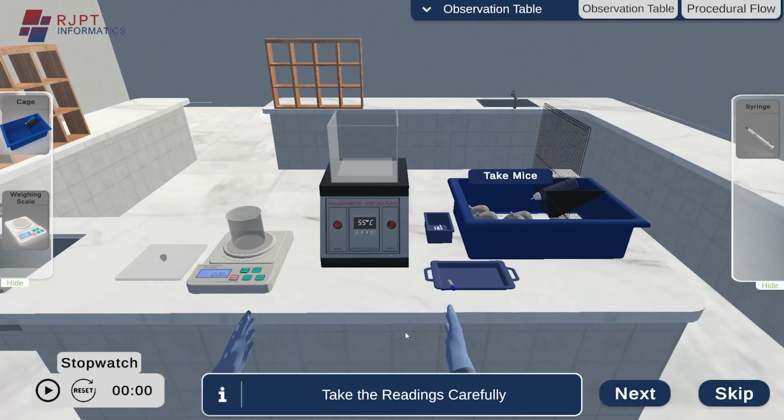Similarly to how we recorded the time for basal reaction, we are now recording it after administering the drug. As we can see here, it waits much longer than the basal reaction time on the hot plate. Through this, we can understand the analgesic effects of the morphine drug.